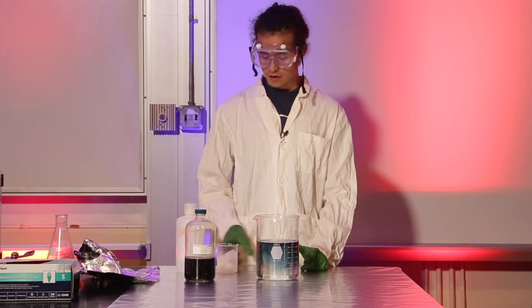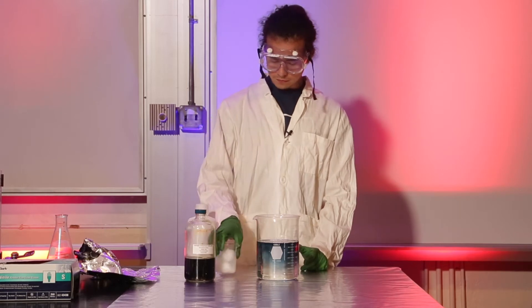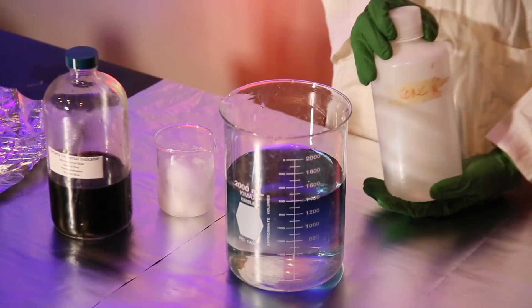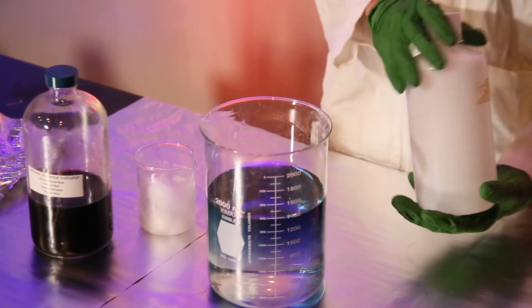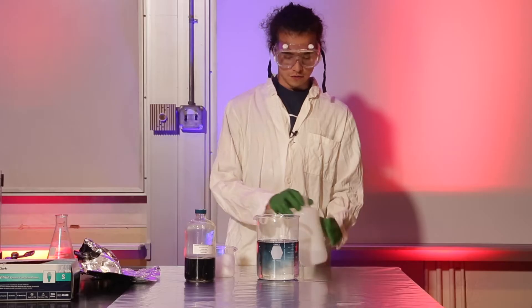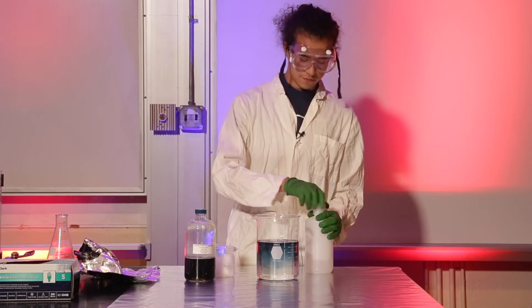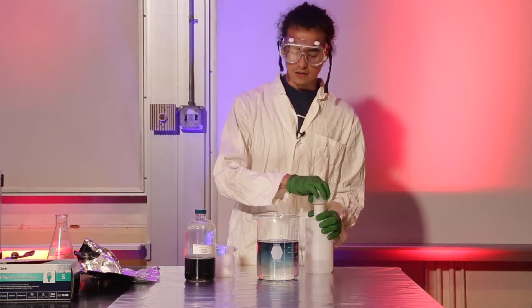Next up we want to see what's in this mysterious bottle. We can't exactly tell what's in here—we got the label ripped off. So we want to see if it's an acid or base, so we're just going to add it in and see what color it changes to.